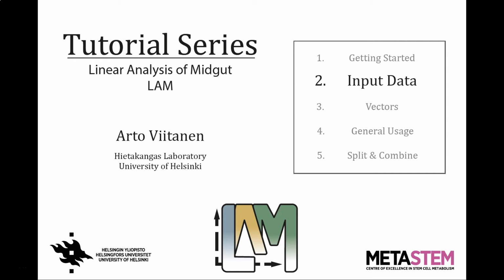Hello! In this tutorial, I will be explaining the required folder hierarchy and contents of input data for a LAM analysis. The folder hierarchy is a crucial part of the functioning of the tool, as it is used to gather information about the samples and sample groups in addition to keeping the data separate.